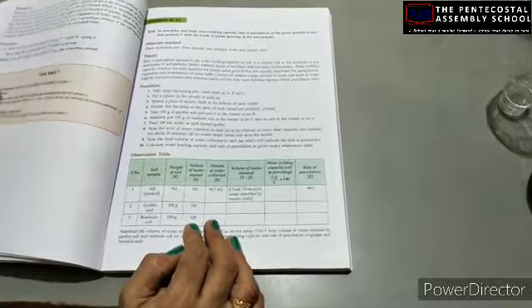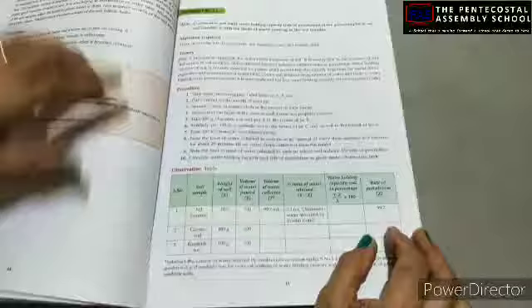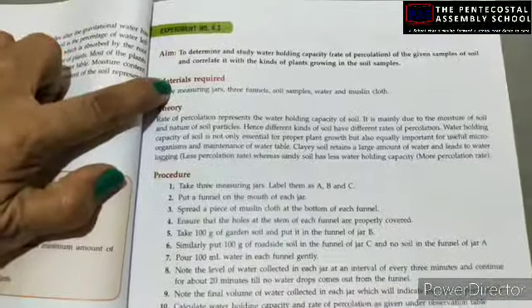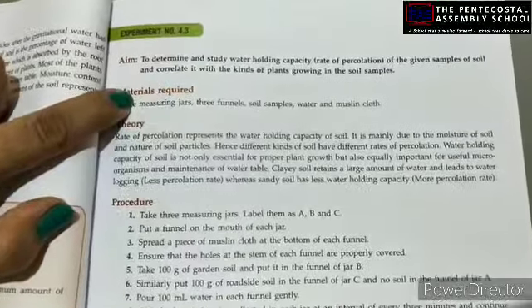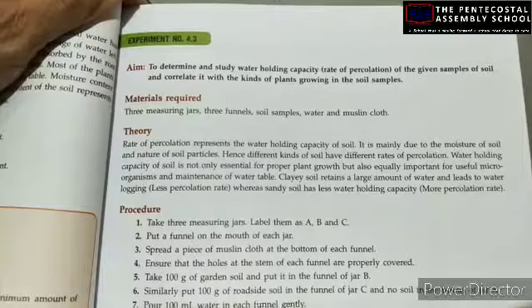Good morning, students. Today the topic of our practical is to determine the water holding capacity of the given sample of soil and correlate it with the kind of plants growing in the soil sample.